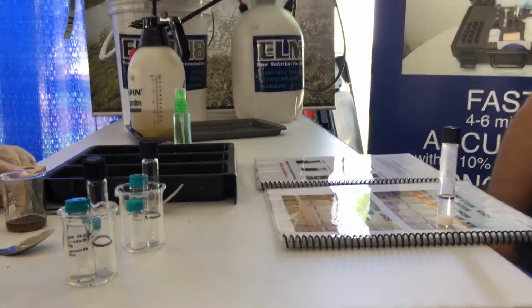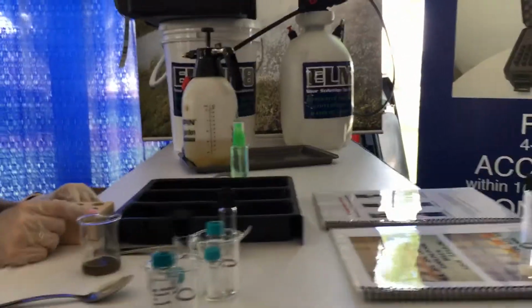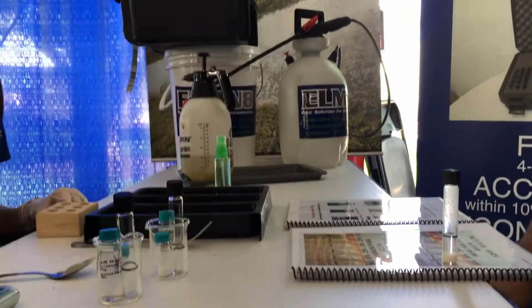I don't want to be in this video. You're out of it. You see how it's stark white. That means we have clean soil. Now she's going to contaminate that soil with diesel.